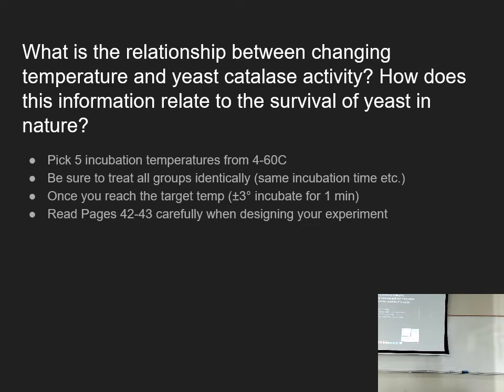It sits there at that temperature for 1 minute. Then you're going to mix the peroxide and yeast together while they're still sitting in that heat block and see what happens. One way students sometimes mess this up, especially when we used to do 5-minute intervals, is they would start the stopwatch as soon as the test tubes went into the heat block. Well, they're still at room temperature when they go in. You've got to wait till they're warm.